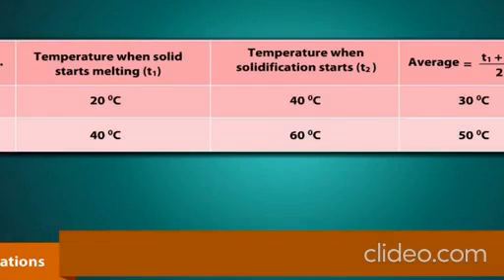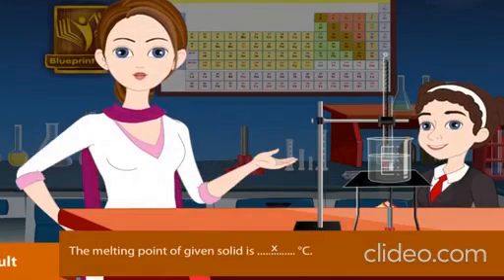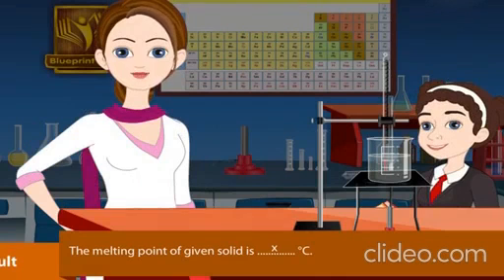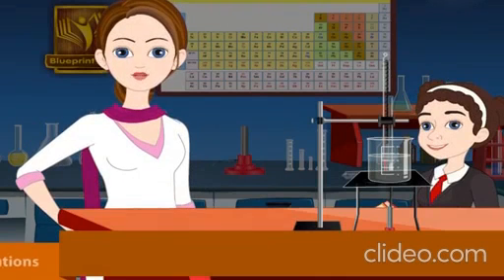Observations. Serial number. Temperature when solid starts melting, T1. Temperature when solidification starts, T2. Average is equal to (T1 + T2) / 2. Result: the melting point of the given solid is X degrees Celsius.